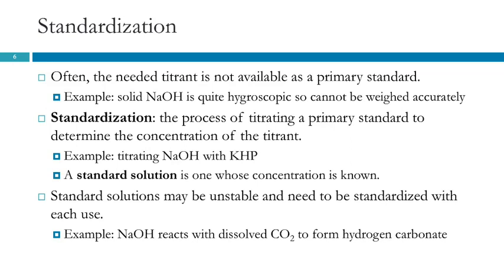Kind of like when you have an open beaker of water or acetone on there, and you can just watch the mass drop as it's evaporating, right? So there's no way you can have a primary standard for sodium hydroxide. And this is true of many of our titrants. So we standardize the titrant. That's the process of titrating a primary standard to determine the concentration of the titrant.